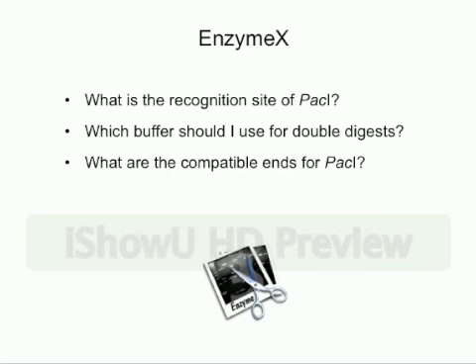What is the recognition site of Pack? No, this is just a restriction enzyme, and you want to know what sequence that restriction enzyme would cut. Okay, just one sequence. So it would tell you the recognition sequence. Right.